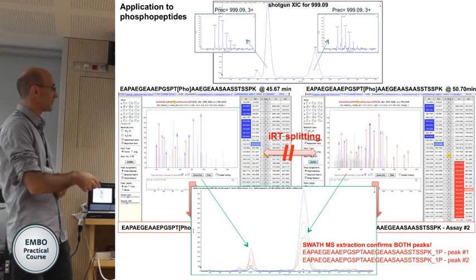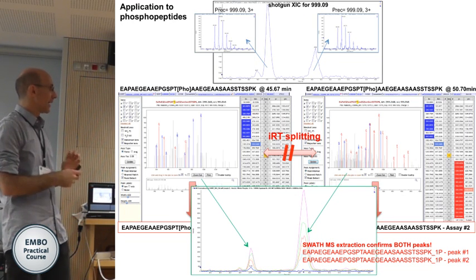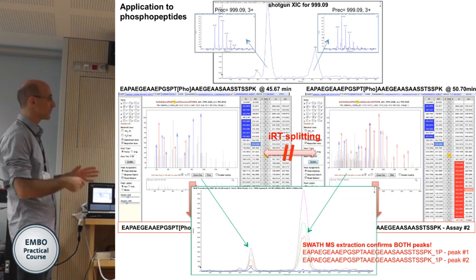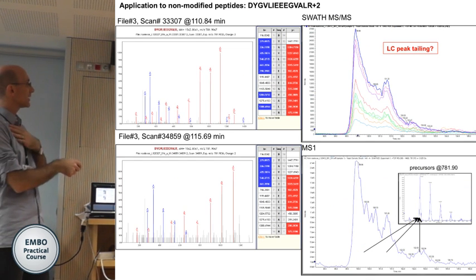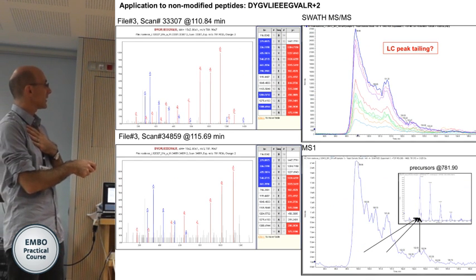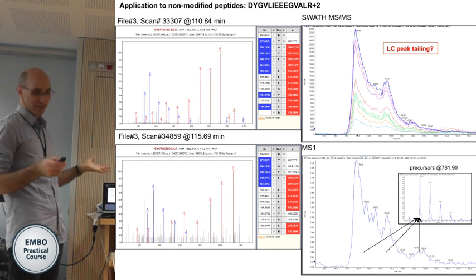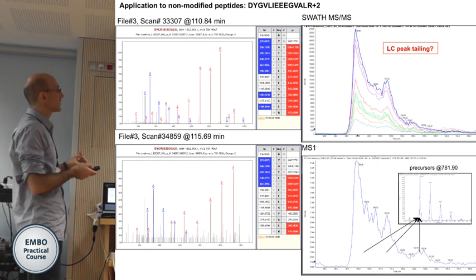So this is something which is not very well taken into consideration in the current pipelines, and this is mostly affecting phosphopeptides so far. So this is something I was very careful in designing for phospho analysis. But if you look at naked peptides, there are actually many cases where you also find peptides like 5 minutes apart. These are naked peptide sequences. There are no obvious modifications where you would say this is actually wrong.